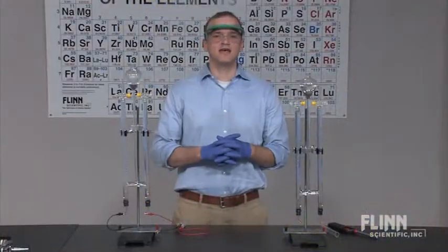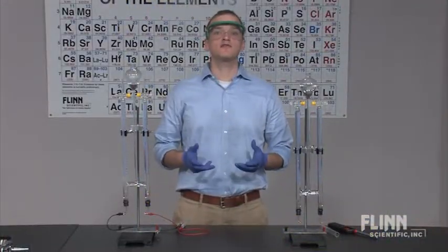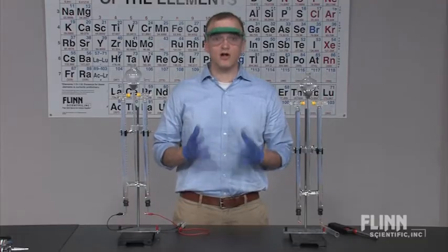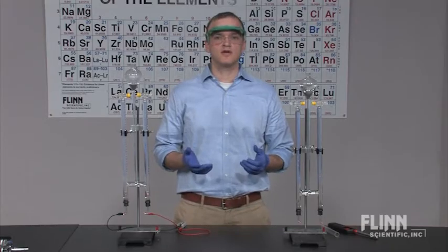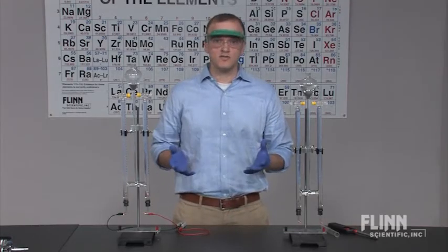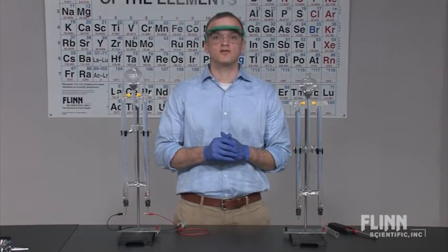The Hoffman Electrolysis demonstration apparatus is rugged enough to last for years and excite students at all grade levels. In addition to stoichiometry, use the apparatus to introduce electrochemistry, the gas laws, and water splitting as a source of hydrogen for alternative energy.